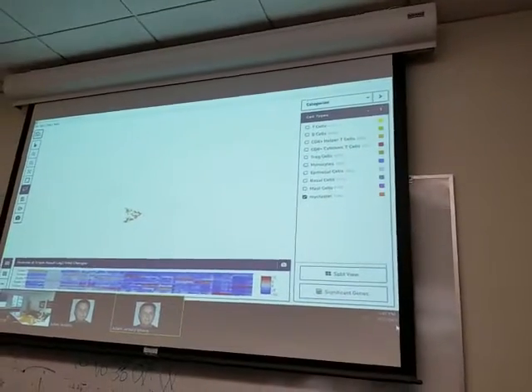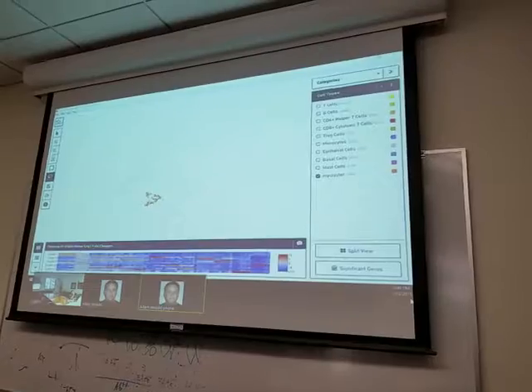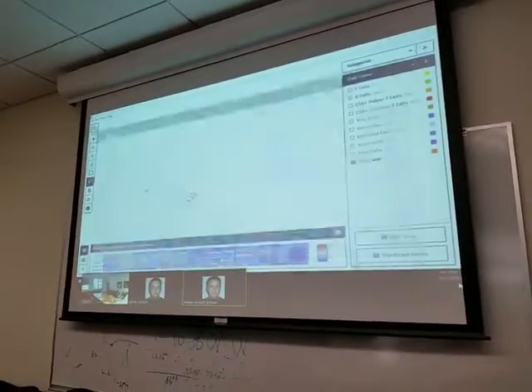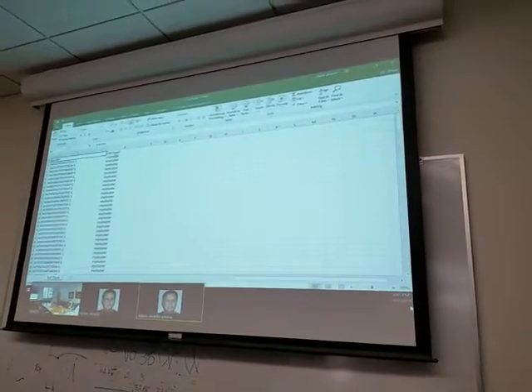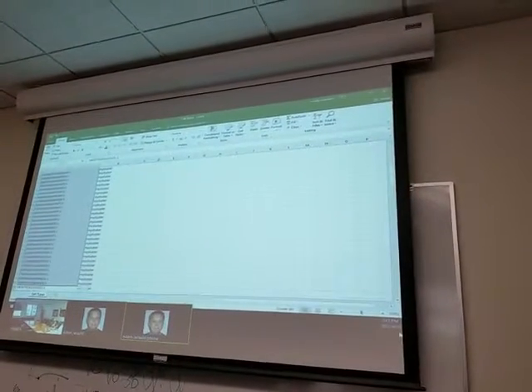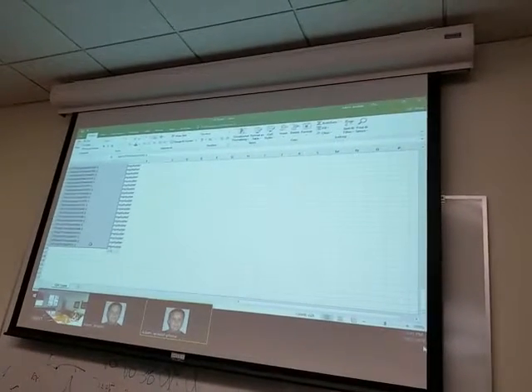So this is going to be a list of barcodes. I've got all these files with the same name on my desktop now, so make sure those are right. Yeah, there we go. So now we have, that was that little triangular cluster. Here are the barcodes that correspond to that, however many there are, the 200 or so.